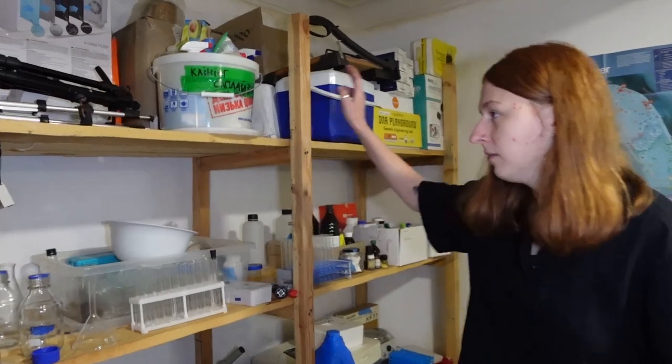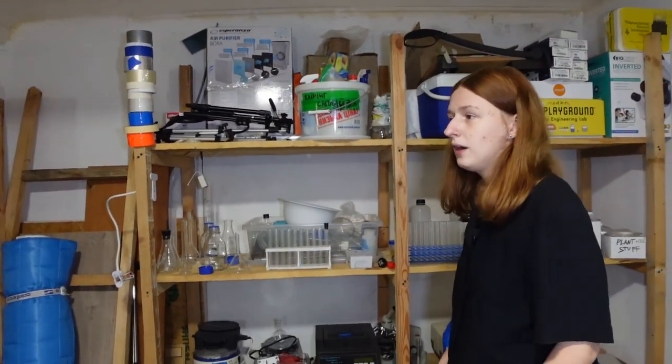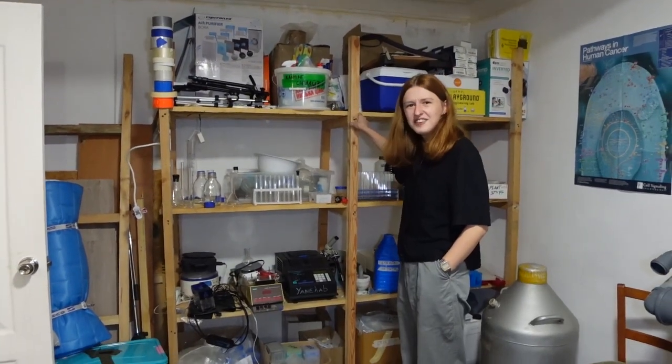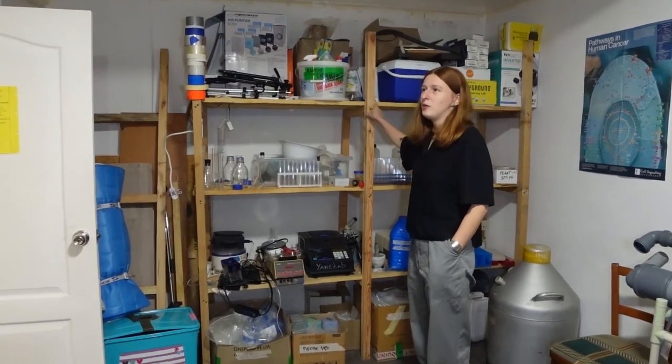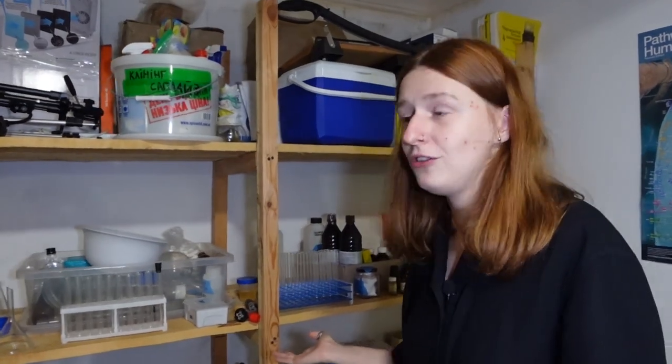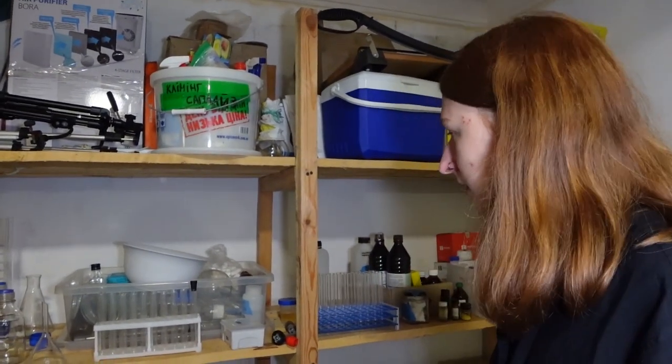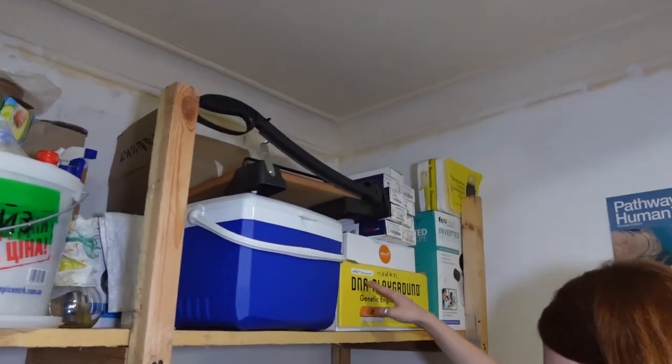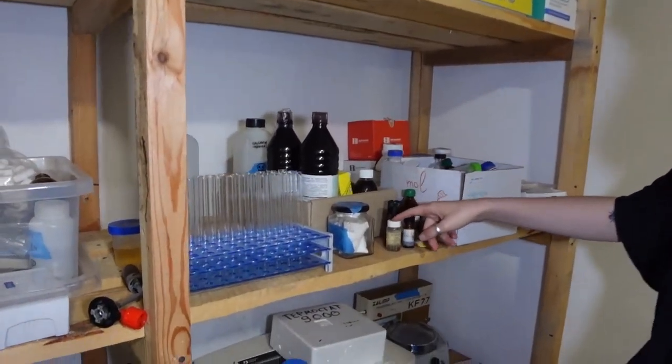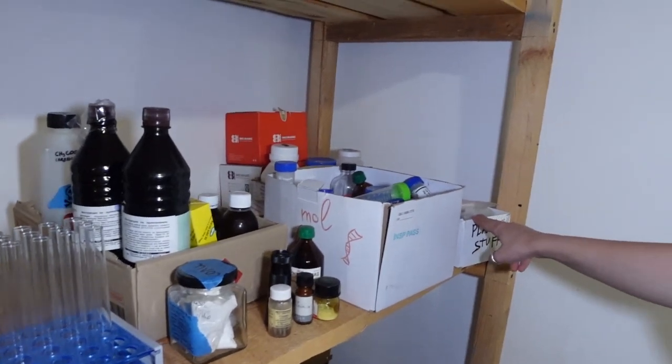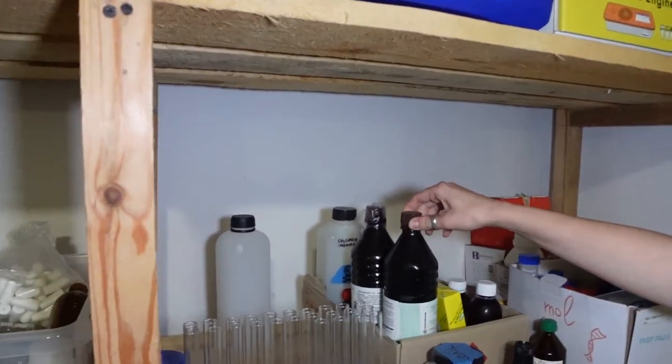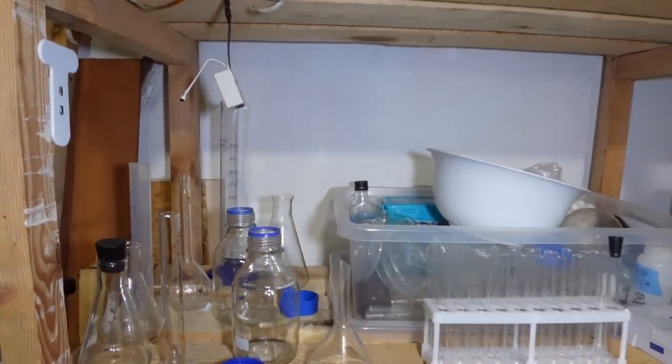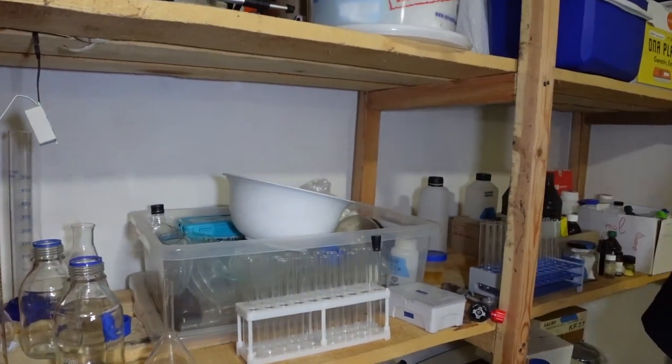We can start from here, I have this custom-made shelf. My dad had a lot of timber laying in his garage and we just made this. It's not very sturdy but we didn't want to spend money on stuff like this when you can spend money on reagents and science stuff. Here we have some glassware, some stuff for filming, some storage, pipettes and stuff. Here we have chemicals, trypsin, everything needed for molecular biology, microbiology, DNA mini preps, some stuff for microscopy and basic glassware.